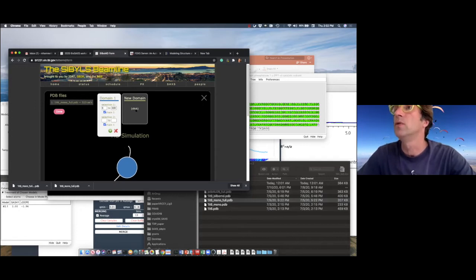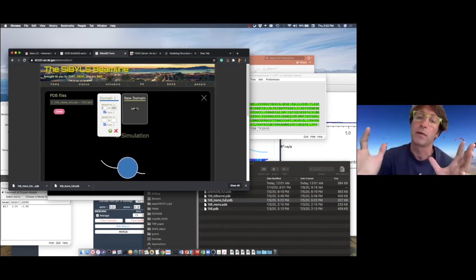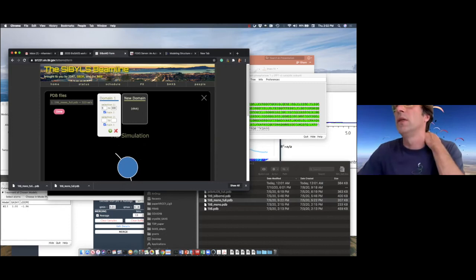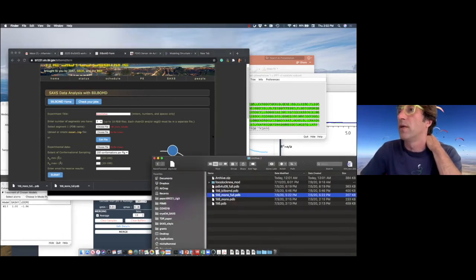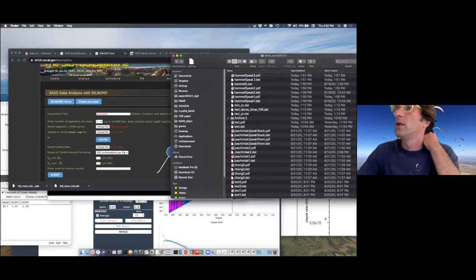When you click on new domain, it allows you to produce different domains that are going to move. If you have a multiple chain protein, you need to enter the chain separately, and again, everything is described in detail in the publication, but it's also kind of intuitive. This is a very simple case, and the simpler the better for the very limited time that we have. And so then I take the const file and upload it.